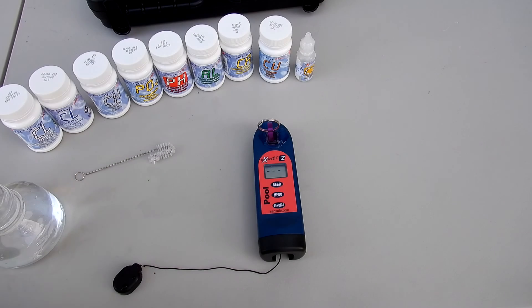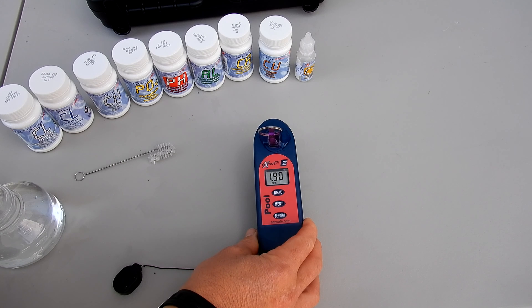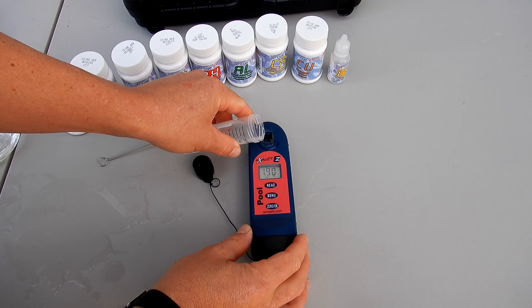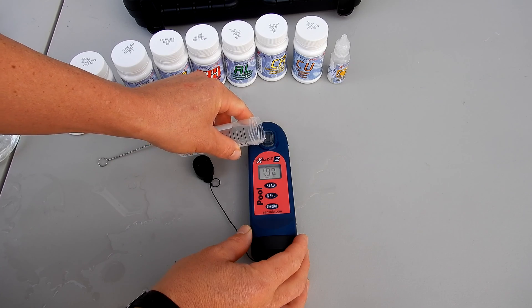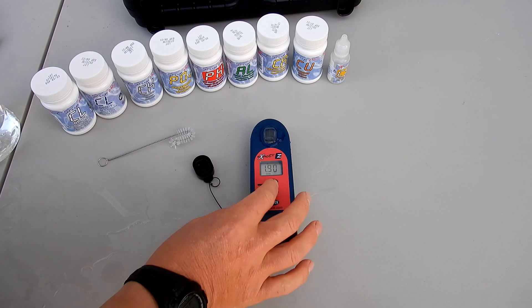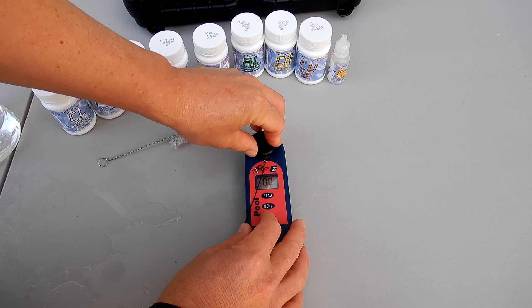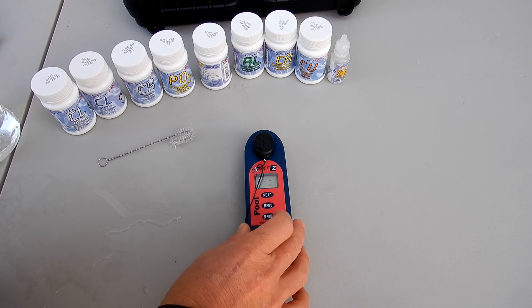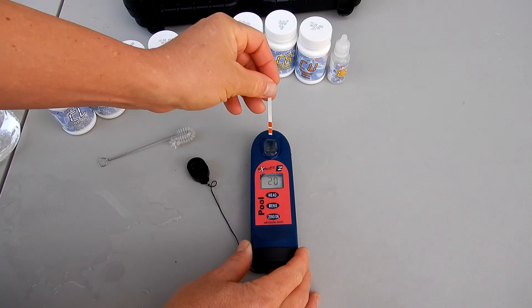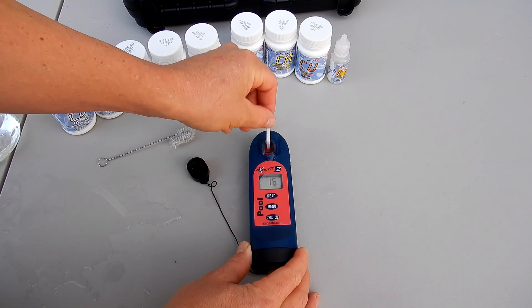Using the Pool EXACT EZ is very simple. Once you verify the calibration when you first get the unit, you can start using it to do the test factors. The first thing you would want to do is fill the cell with some water, then select the test factor you're testing for. For pH, you want to go ahead and zero out the meter, then insert the test strip, hit read, and move the strip back and forth about twice every second.